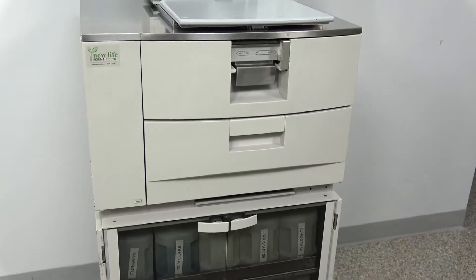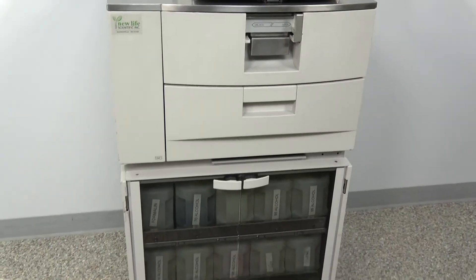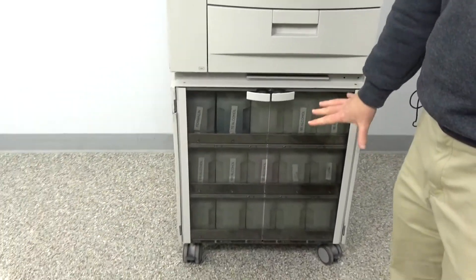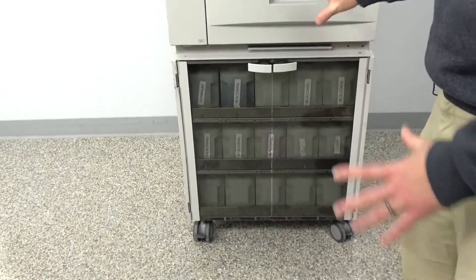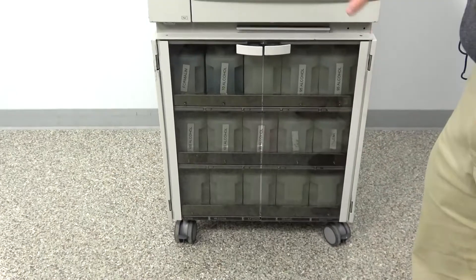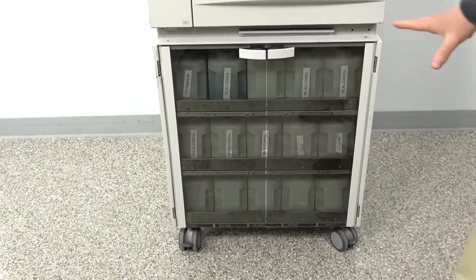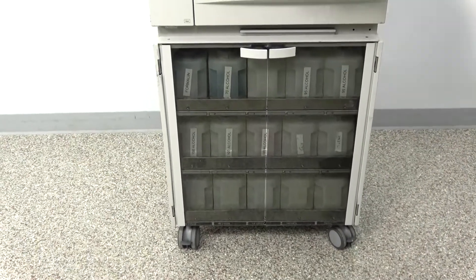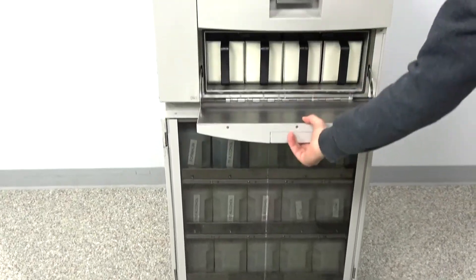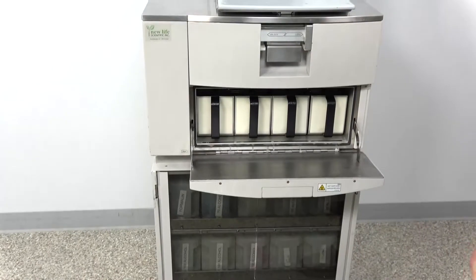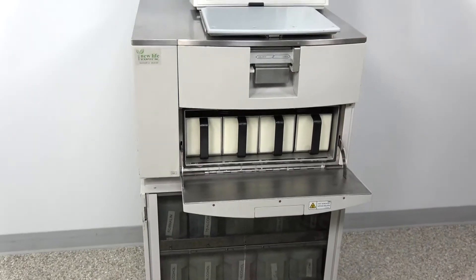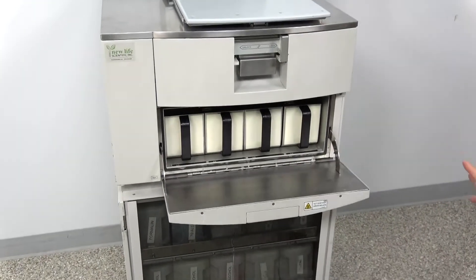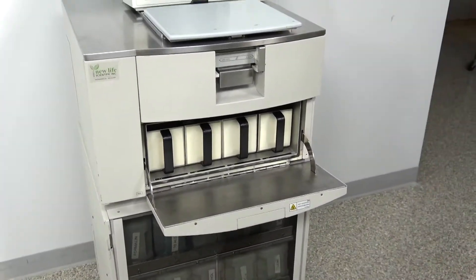This is complete with all the bottles. For those of you that have ever tried to buy bottles for a VIP 5, you will know they are outrageously expensive. So you've got all your bottles, you've got all your wax reservoirs in here. These are things that you would hope to see, but just so you know, they're there.